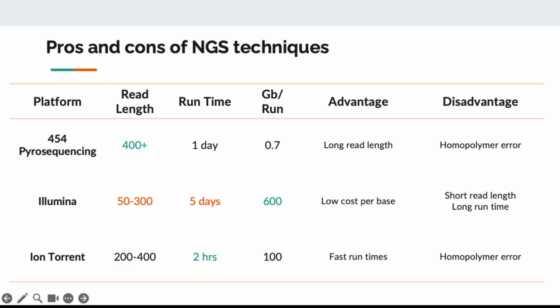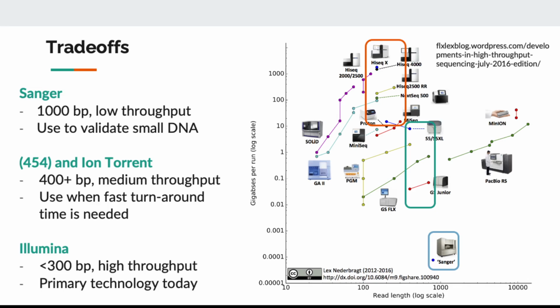But nowadays we will talk about nanopore sequencing, which will be even faster. So essentially, only Illumina might be considered today for use. Okay, and this is a trade-off for every technology. For DNA sequencing, we care about 2 metrics. The first one is the throughput, like how many nucleotides you can read within an hour. The second metric is how long of a nucleotide you can read.